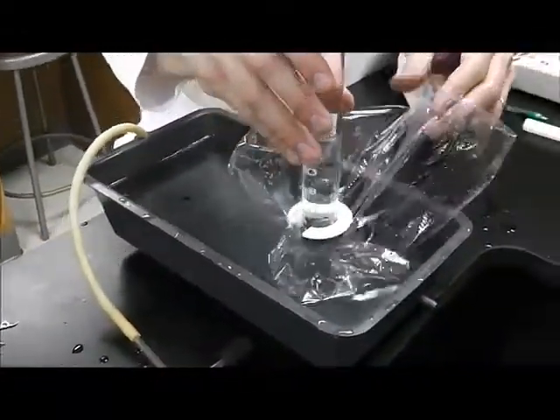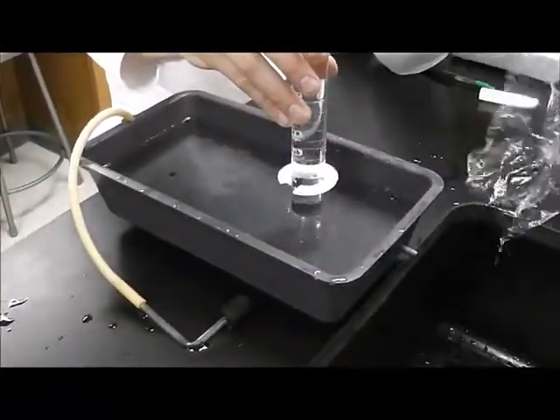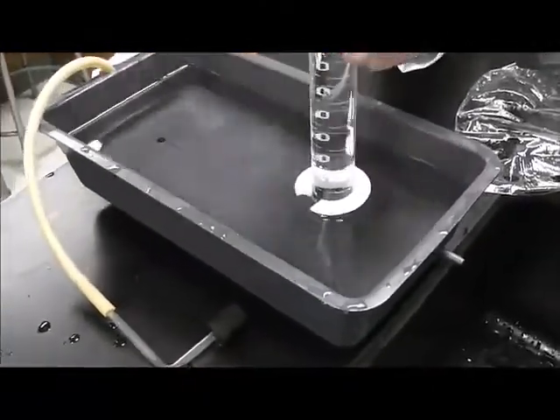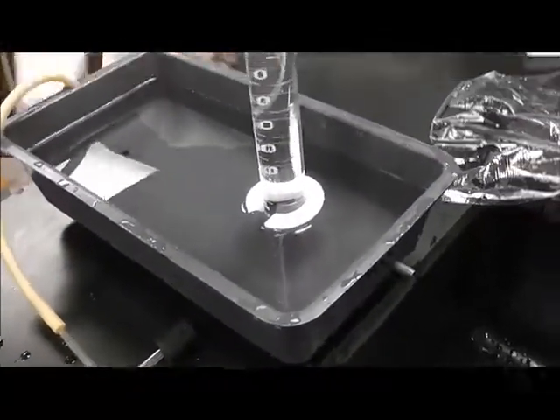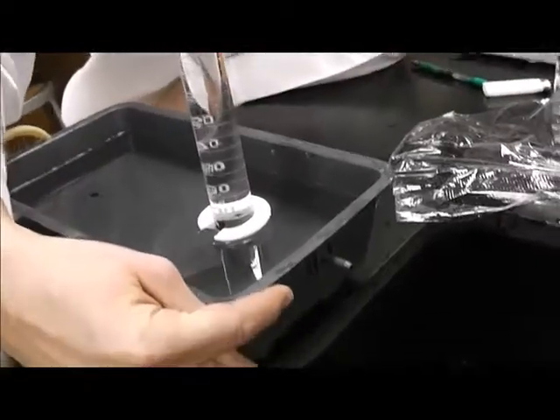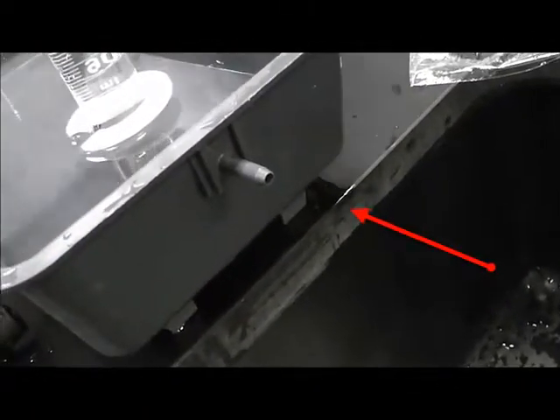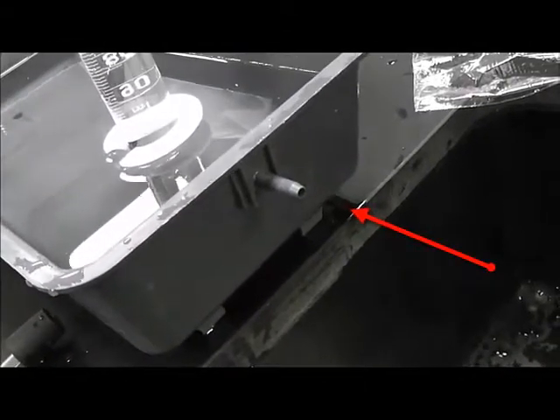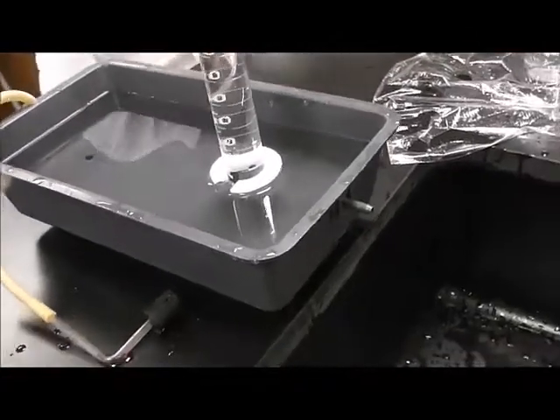Like that. Once you've inverted it, you can pick up the graduated cylinder and pull off a little bit until you get it like that. Now this should stand up just fine in the water trough. One thing to note about the water trough, guys: there is a little hole in it, so the water will come out into the sink. Don't put the hole over the middle of the lab table. You'll get things wet.